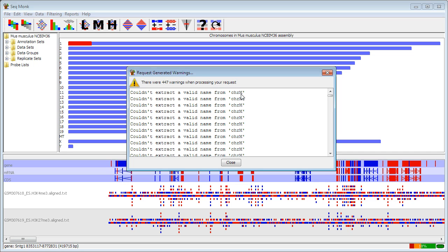One thing that you may see that is important to note: you may find that you get reads that are supposedly mapping to a position which is beyond the end of the chromosome. If you see that and the mapped position is more than a few bases over the end of the chromosome, it's nearly always an indication that you've selected the wrong genome assembly when you started your project. It's worth going back and stopping at that point and checking that it's right, because otherwise you may misinterpret your data later on.